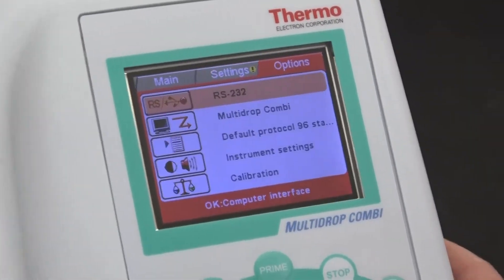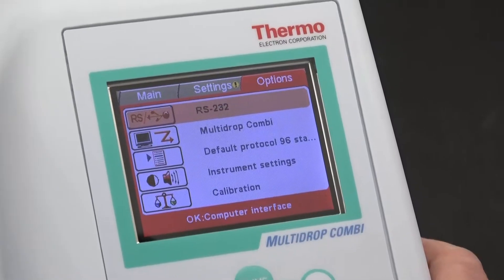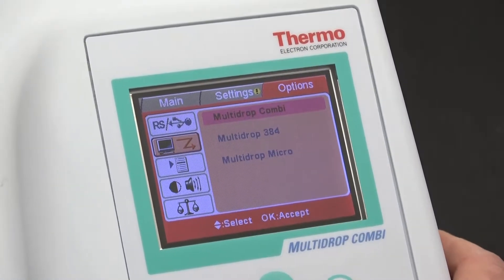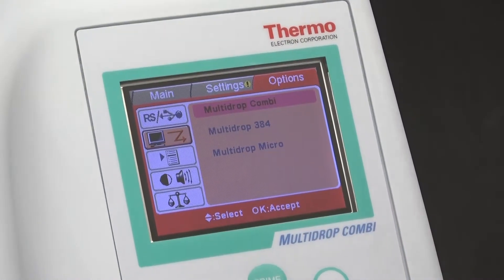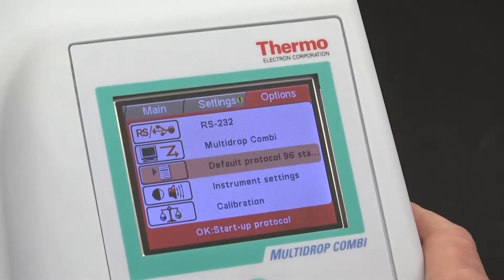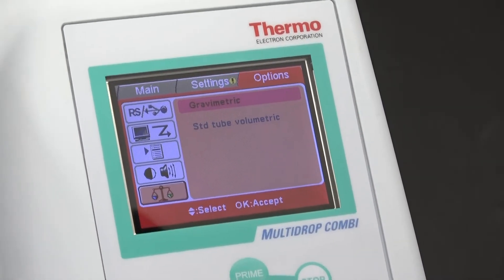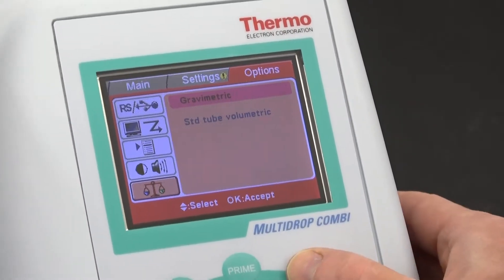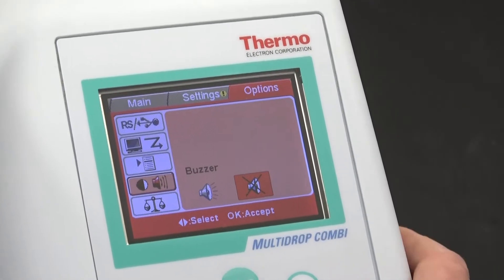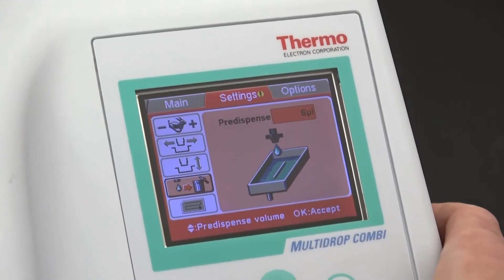In the options, you can change your communication method between RS-232 and USB. You can also change your operating mode — there are other Multi-Drop models. The Combi allows you to do a variety of things as opposed to the 384. You've also got some instrument settings and calibration — you probably want to calibrate this before you use it, especially if you're doing something really important. Instrument settings: do you want a buzzer or not? That does matter if you're going crazy all day with the beeps. Anyways, these are your options in the Multi-Drop Combi.